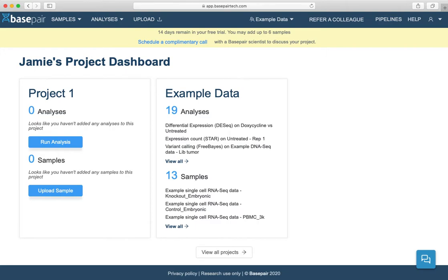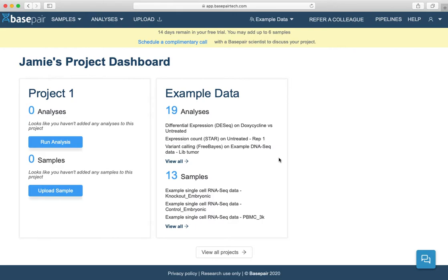When you first log into your dashboard you'll see two projects: Project One, which is automatically created for you and where you can start uploading your samples, and Example Data, which is where all the example data reports are stored. You can always access example data reports by clicking into the analyses, but keep in mind that the example data project is view only, so you can't run your own analyses on this data. You'll want to upload your own samples into Project One instead.